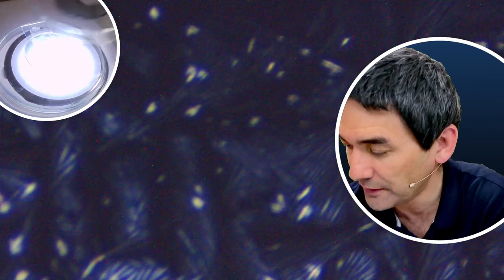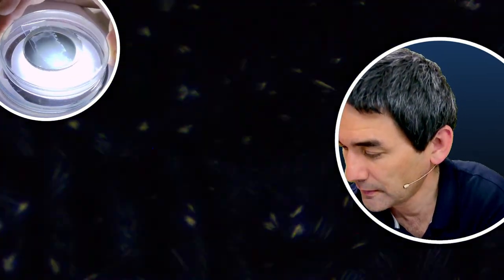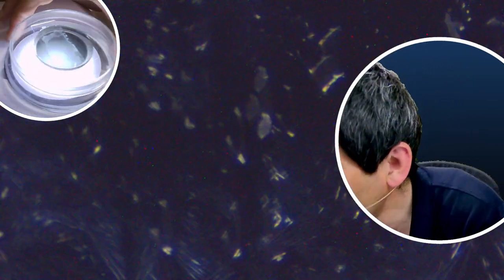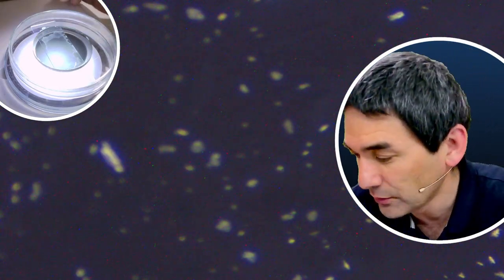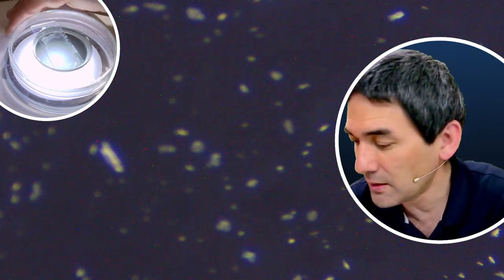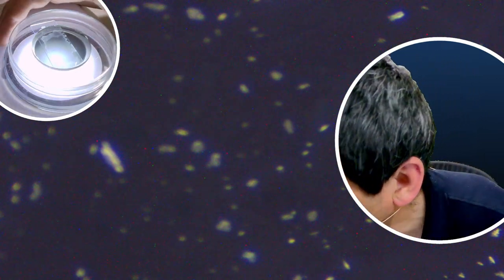I'm going to aerate the whole thing now a little bit. Weird. That's because I do still see that it's a little bit moist still, but maybe, I don't know. Could it be that somehow the solvent flushed all of the substance to the side? I don't know about that. Strange. Yeah, there is a very thin film of crystals now on the surface, but by far not as much as I was hoping for.